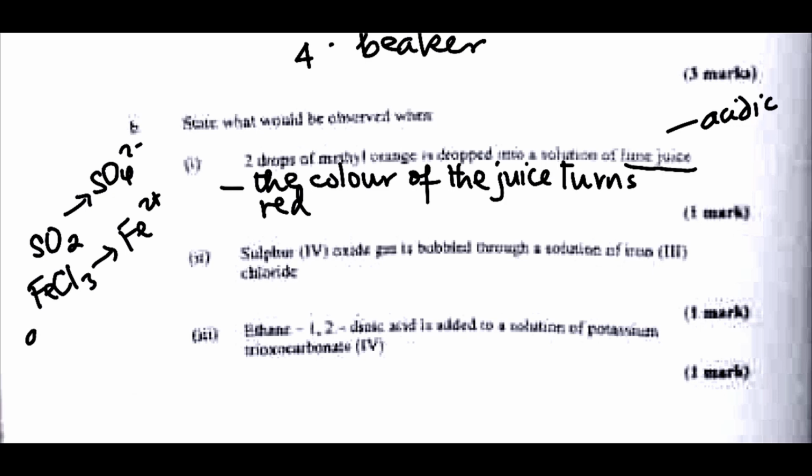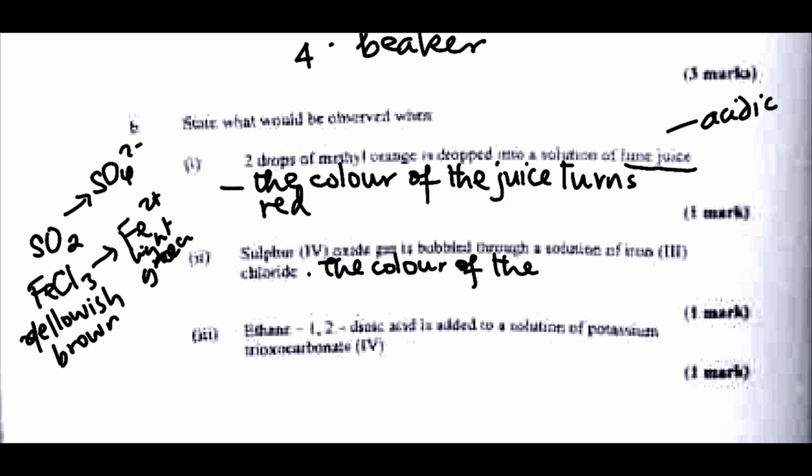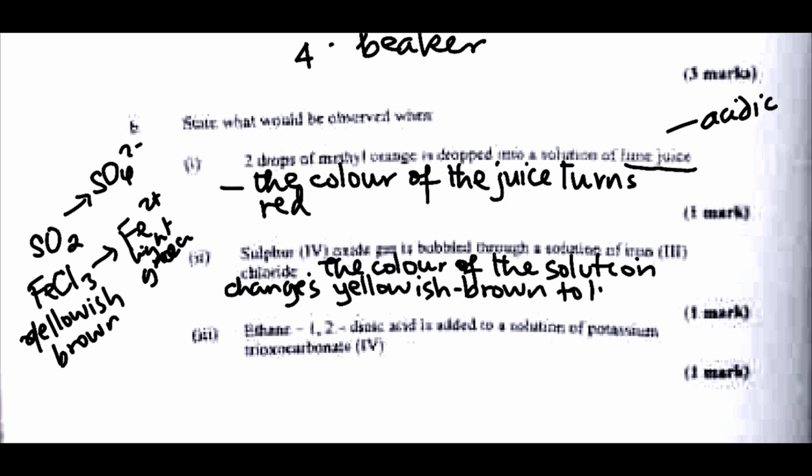The color of the solution changes from yellowish brown to light green, due to the reduction of iron(III) ions to iron(II) ions.